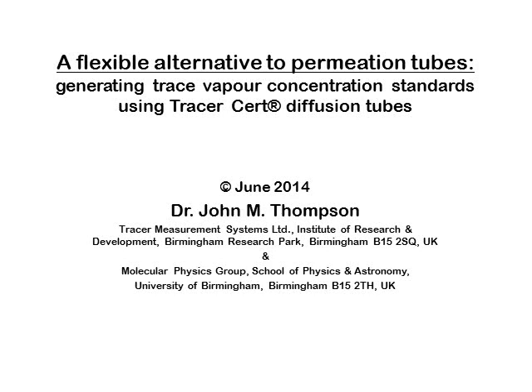In this video presentation, a flexible method is shown for adding reliable standard trace concentrations of vapours into small to medium gas flows. With the following two slides, I shall explain what we mean by a vapour and how a vapour differs from a gas.